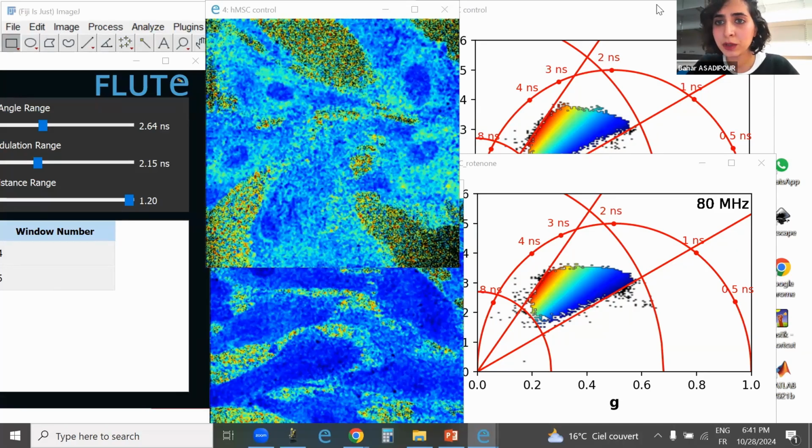So is there any way to demonstrate the distance measurement? I am thinking that whatever the value is from the distance measurement from free NADH is the fractional value for bound NADH, but I just want to make sure that is correct. I don't know if Chiara has.